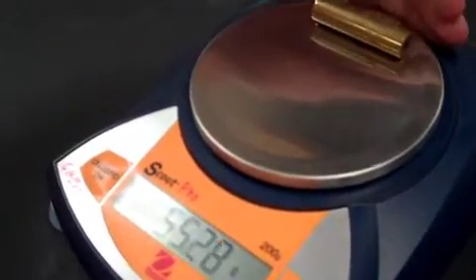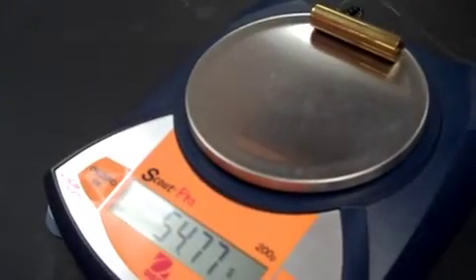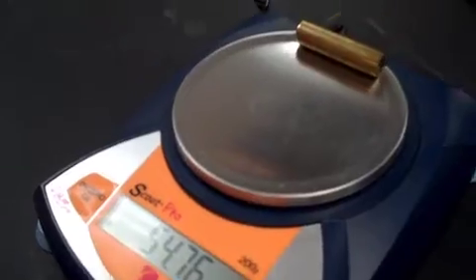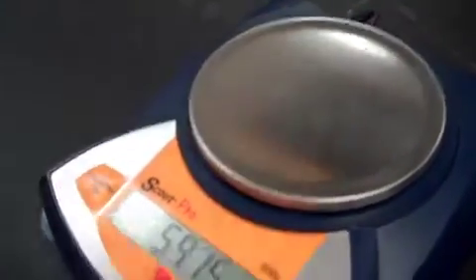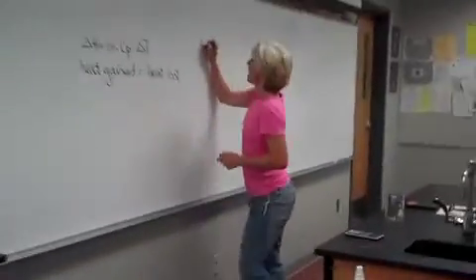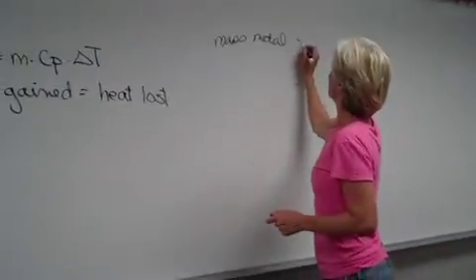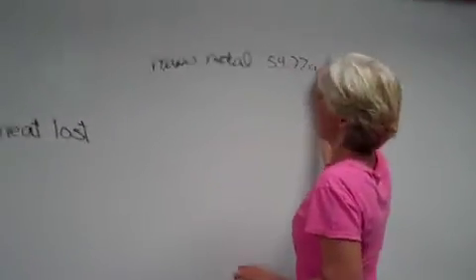Don't fall. And it looks like it's 54.77 grams. Okay, let's come on over here. Mass of metal, 54.77 grams.